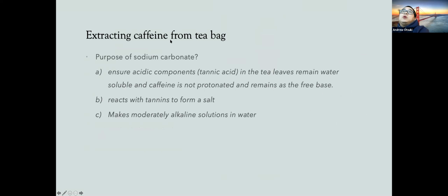The carbonate also reacts with tannins to form a salt, so that makes it more water soluble. That makes our lives easier, and it makes the solution moderately alkaline. That's a good thing, because we want to make sure it's neutralized. We don't want this caffeine being protonated. Okay, so that's why we use this carbonate solution.